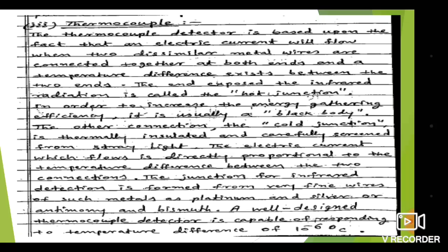So for making a thermocouple, we use platinum and silver metal, or antimony and bismuth. A well-designed thermocouple detector is capable of responding to a temperature difference of about 10 to the power minus 6 degrees Celsius.